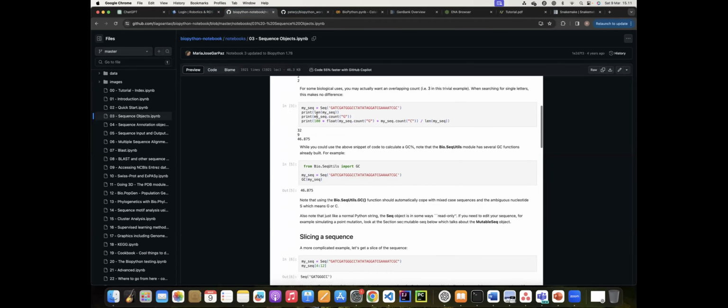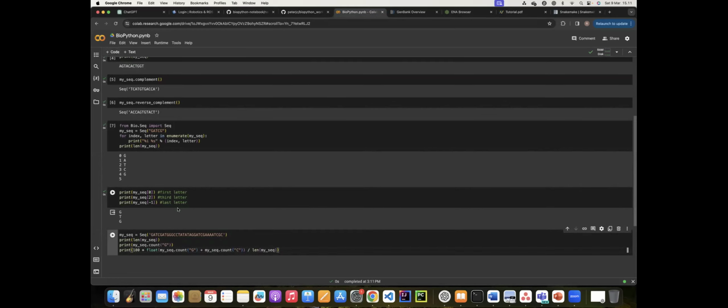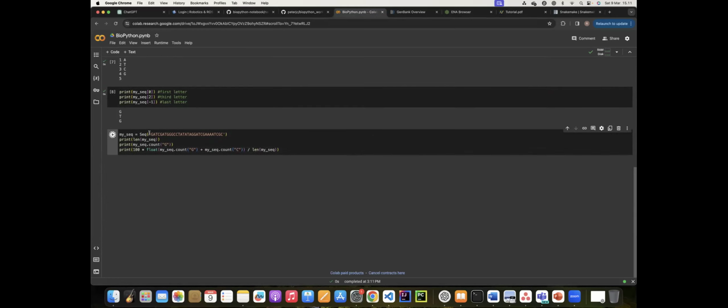Okay. So first you copy and paste and look, oh, this is my sequence, and then they print it, and then they count how many G are inside the sequence. Yeah, this code is based on Python, so easy to understand. From this sequence, I just print the length of the sequence, how many digits, 32, and then count the number of G, which is 9, and then print it, okay?